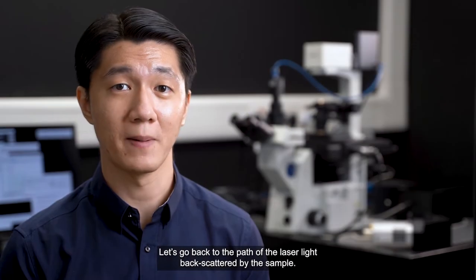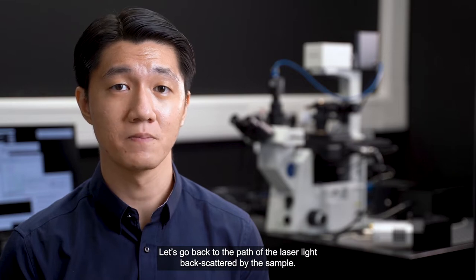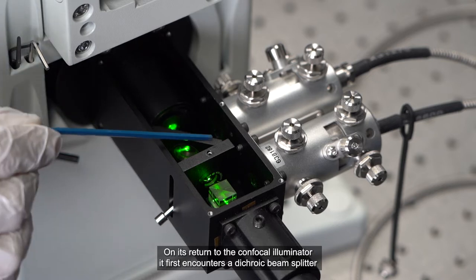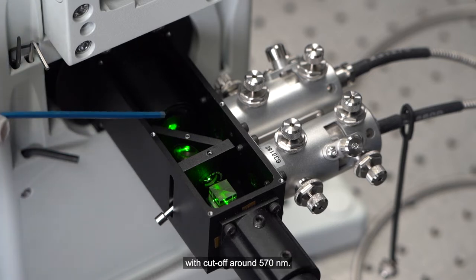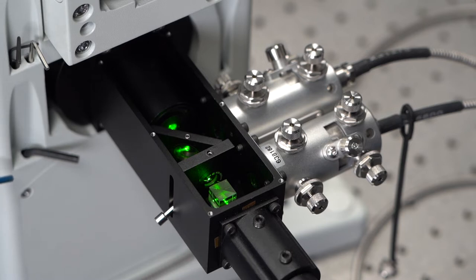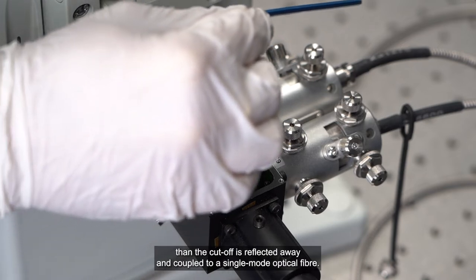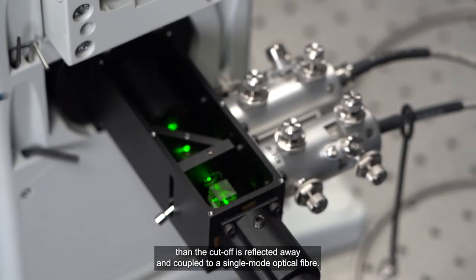Let's go back to the path of the laser light backscattered by the sample. On its return to the confocal illuminator, it first encounters a dichroic beam splitter with cut-off around 570 nanometers. Here, Raman scattering with wavelength longer than the cut-off is reflected away and coupled to a single-mode optical fiber.